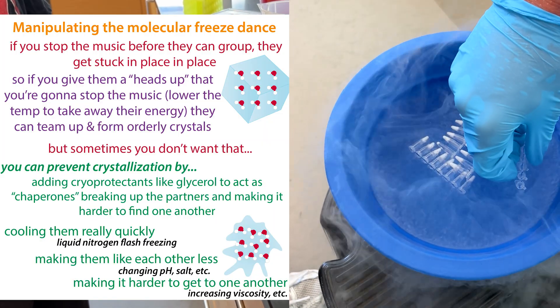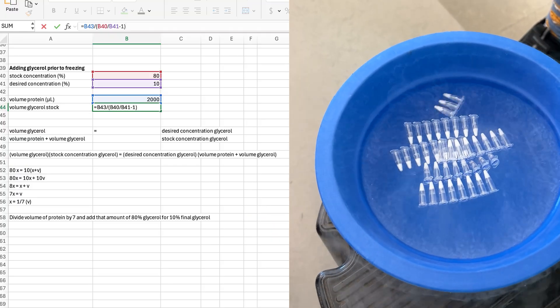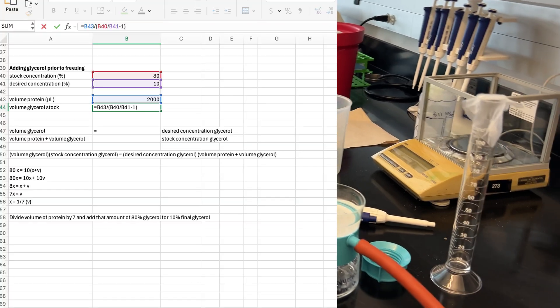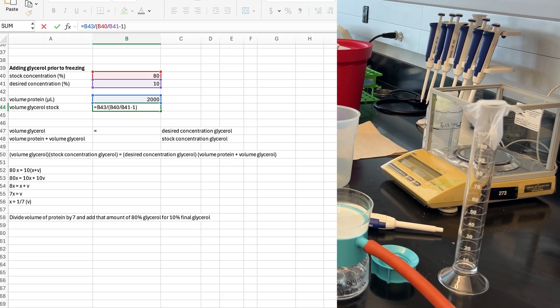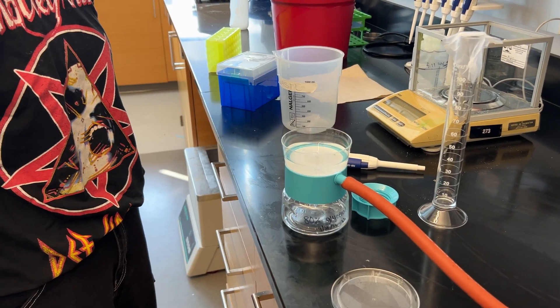We will add the 80% glycerol to reach a final 10% glycerol — so it'll be an eight-fold dilution. We take the volume of our nice purified protein and divide that by seven. Then if we add that volume of 80% glycerol to the seven parts protein, we'll come down to 10% glycerol.